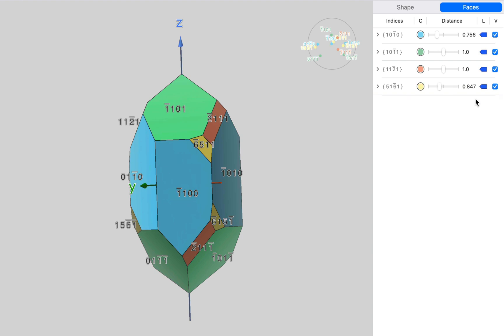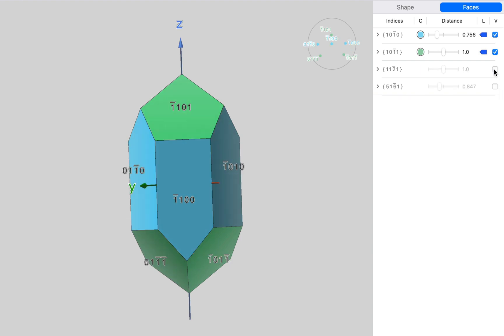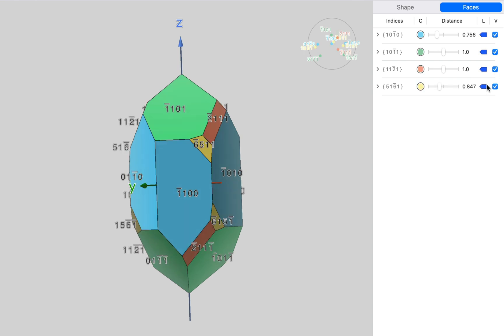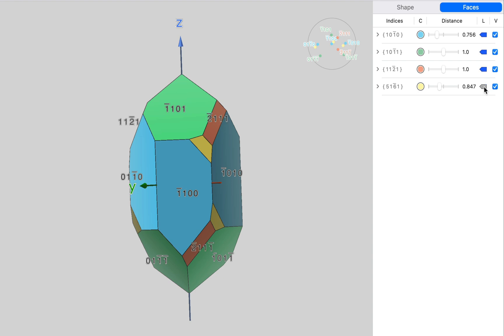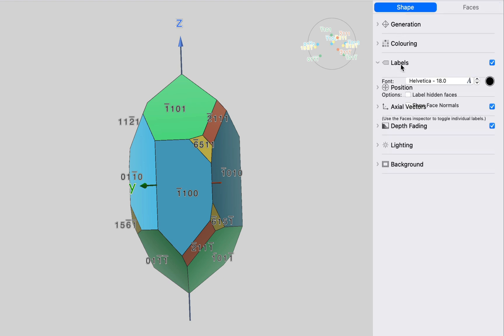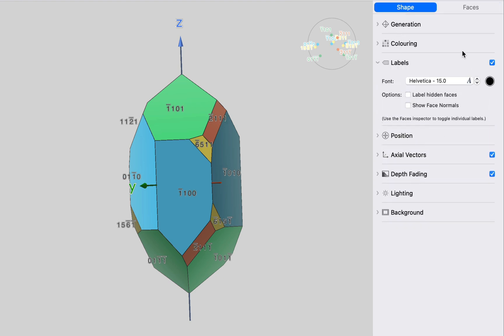Notice that we can turn off sets of faces by clicking their visibility checkboxes. And you could also toggle the labeling on and off by clicking the label checkboxes. I think we'll make those labels a little bit smaller. There we go.